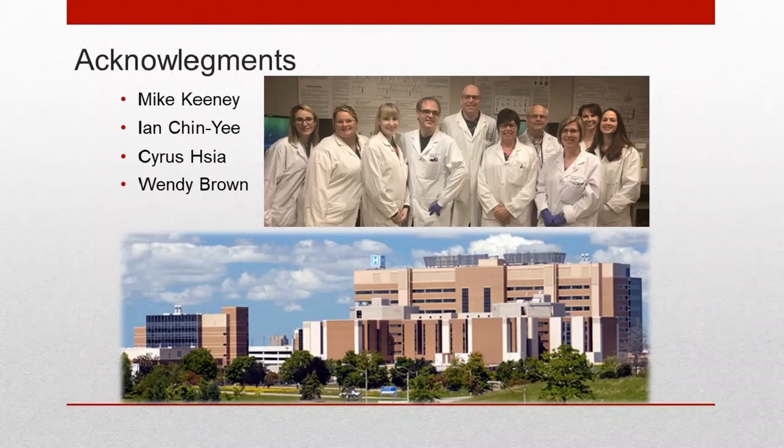Thank you. So how do you integrate this with other LDT panels? Specifically, do you use the same instrument settings or not? Yeah, so the way that this is set up, Beckman Coulter do supply all the setup and everything really required to run these panels, and they're IVD released, so the way that it's set up is the way the manufacturer intended, and it has a guaranteed way that it works, which is the way that we've used it.